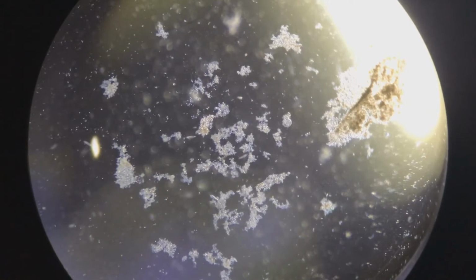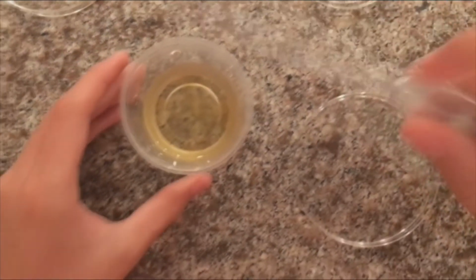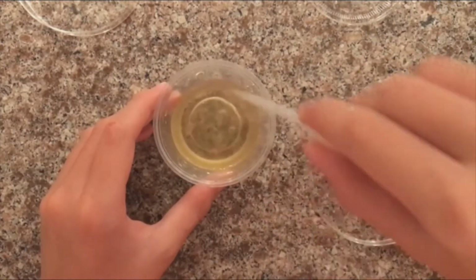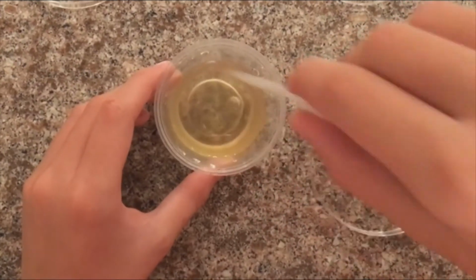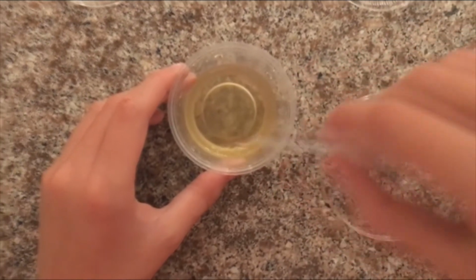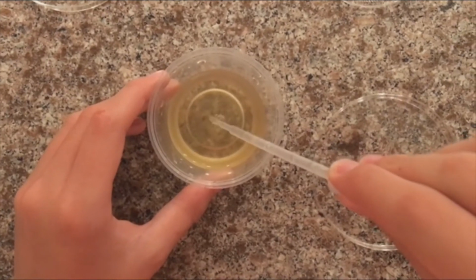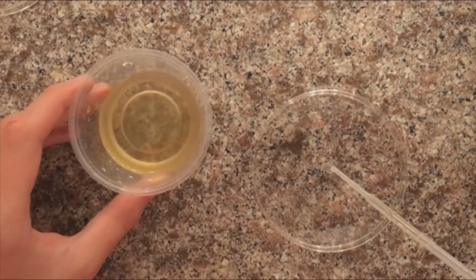A stereoscope was then prepared for use. After uncapping one plastic cup, a pipette was used to swirl its contents thoroughly for 5 to 10 seconds. 1 drop of the liquid was taken from the center of the plastic cup and placed into the middle of a sterile petri dish. The number of Paramecium aurelia present in the drop was then counted and recorded. Using the pipette, the drop was then returned to its original colony.